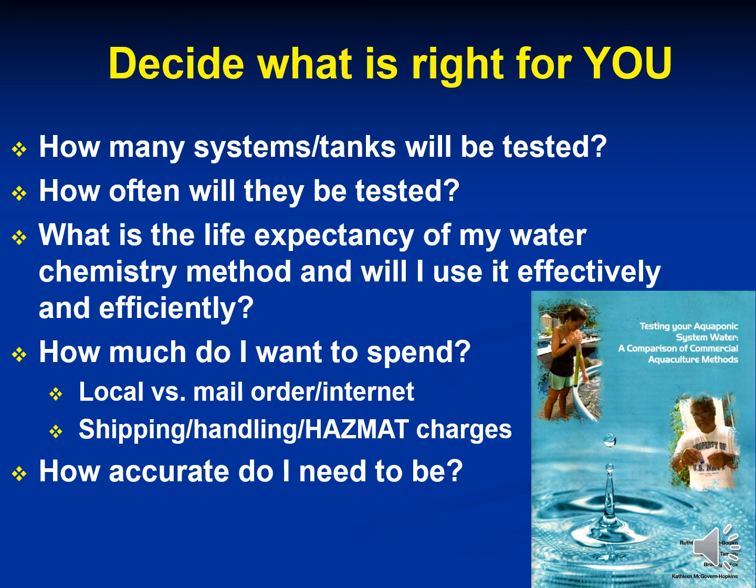For a backyard aquaponic system, I recommend having an aquarium test kit that can measure pH, TAN, nitrites, and nitrates, a hydroponic pH water test kit, or even better, a pH pen meter, a total alkalinity water test kit, a TDS meter, and a DO meter, which also will record temperature.